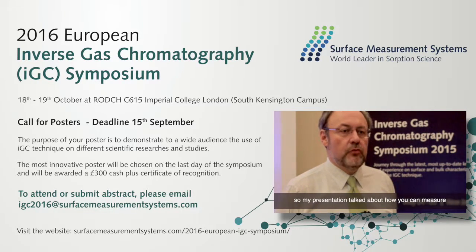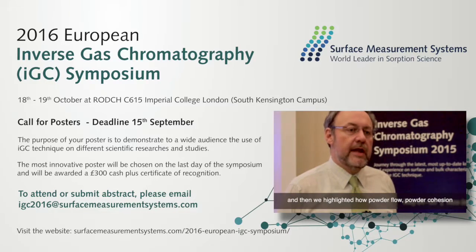So my presentation talked about how you could measure the surface energy of powders, pharmaceutical powders to be precise, using inverse gas chromatography. And then we highlighted how powder flow, powder cohesion, and indeed the milling of powders can be directly related to the surface energy of the powders we've actually got.